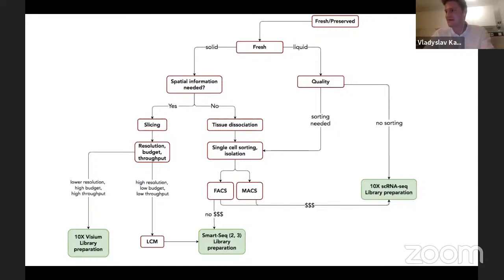Yeah, that's something that can be used in that case that can fix your proteins and that will not disrupt your RNA integrity. So, can spherical cells with phenotypic characteristics be microdissected? How much can the laser affect the gene expression of single cells? You must understand that the laser lasts maybe a few seconds. That means where you are cutting out, you will destroy everything, but in the middle that you cut out, you will preserve everything that you had.